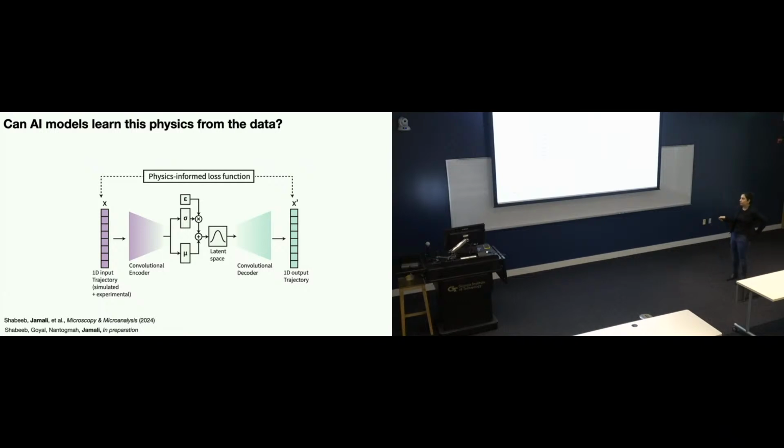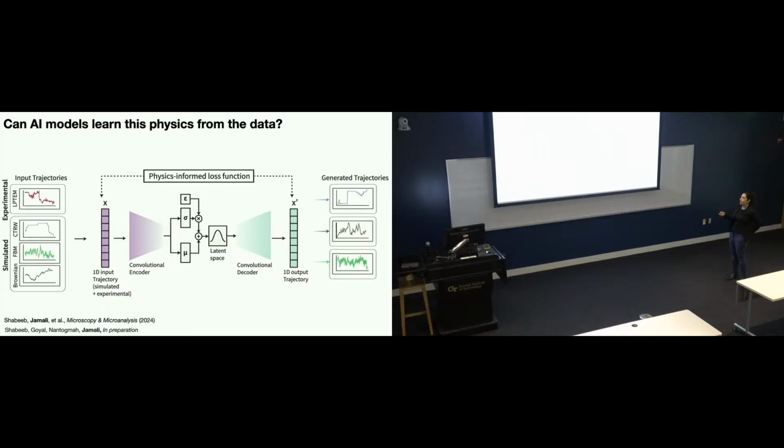So you have a model that learns the physics of this data, basically a black box simulator. If you input a CTRW, FBM, or Brownian trajectory and encode it, it can then generate trajectories that have exactly the same statistical properties as the data you would collect from any of these. So not only the ones that we have a closed form equation for, but things like liquid phase TEM that we do not necessarily have a closed form equation for.